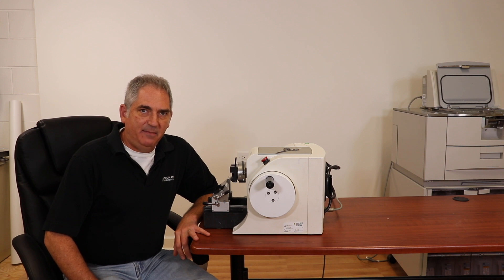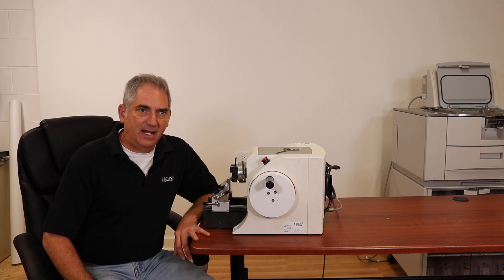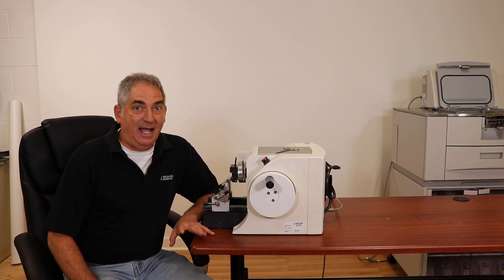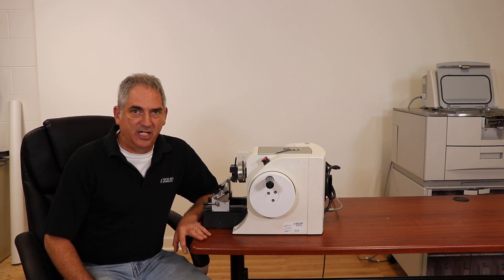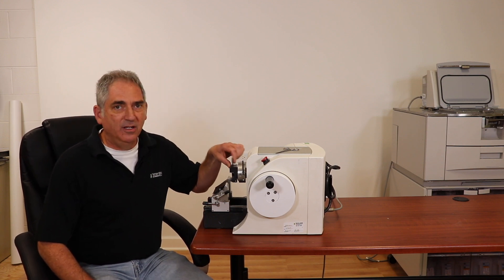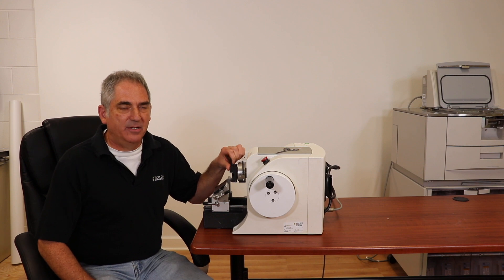I was at a state society meeting in the spring and one of the techs came up to me and asked, do you have any idea where I can get a lever extension for my Microtome cassette clamp? I had no idea what she was talking about, but she explained it to me. She said it's an extension for this lever and it just makes it easier to get cassettes in and out.